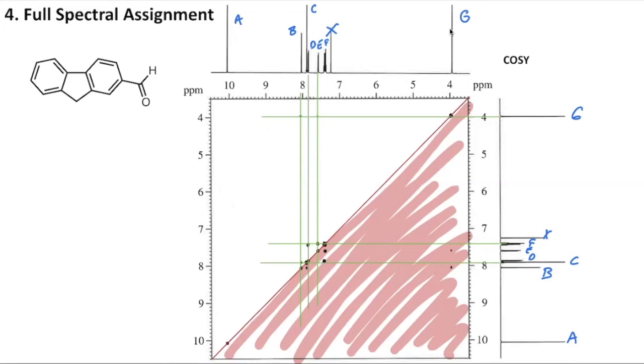So you can see why this very last cross peak here, I'm going to circle it, is a little tricky, right? Because it seems like it could kind of line up with either C or D. So I think that it's lining up with C. And I think that'll be a little bit more clear when I can remove some of these annotations. So I'm going to label it as a C correlation peak for now, but we can always come back and edit that later. Definitely make a note while you're working on these to say, these 2 peaks are close together. If things seem suspicious or we're having trouble getting to our final assignments, maybe come back and reevaluate this particular point.